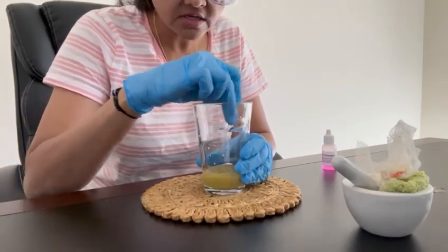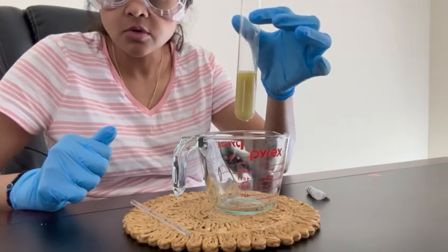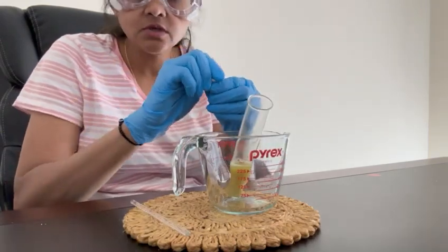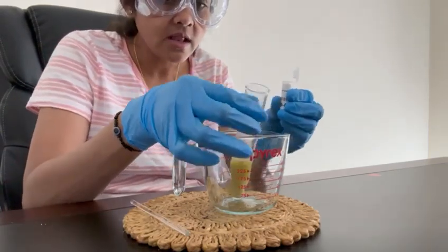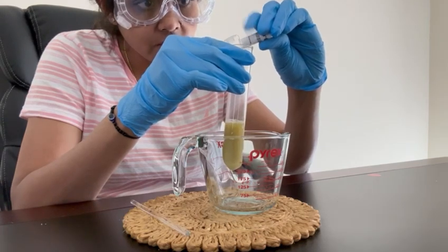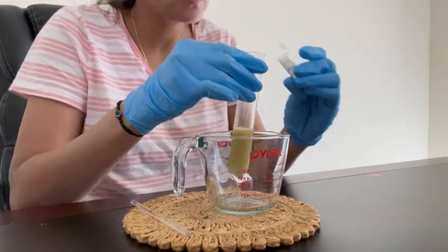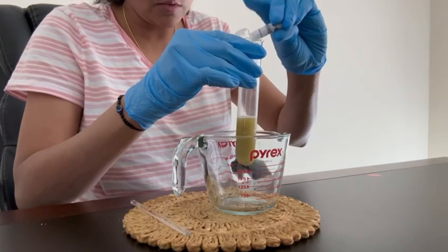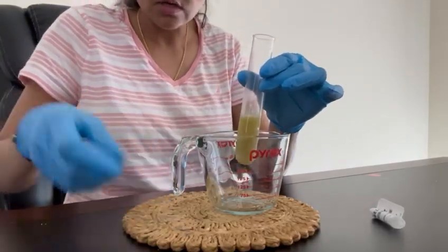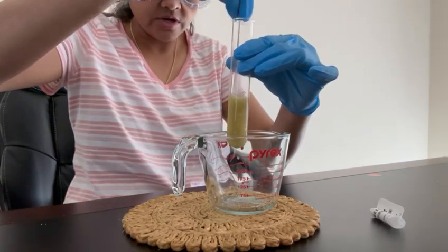So it's been 10 minutes and I have transferred the solution into the tube. It's about one third full, and I'm going to add the papain powder. It's an enzyme. Its function is basically to help separate or isolate the DNA from its surrounding protein. I'm going to add about half, a little bit more. There you go. And I'm going to mix it with the clean glass rod gently, and make sure not to break the DNA.